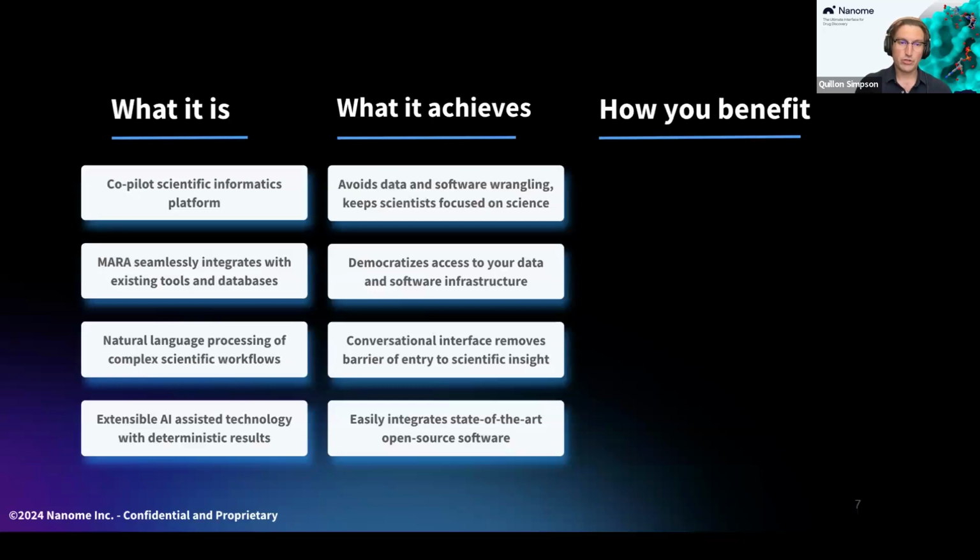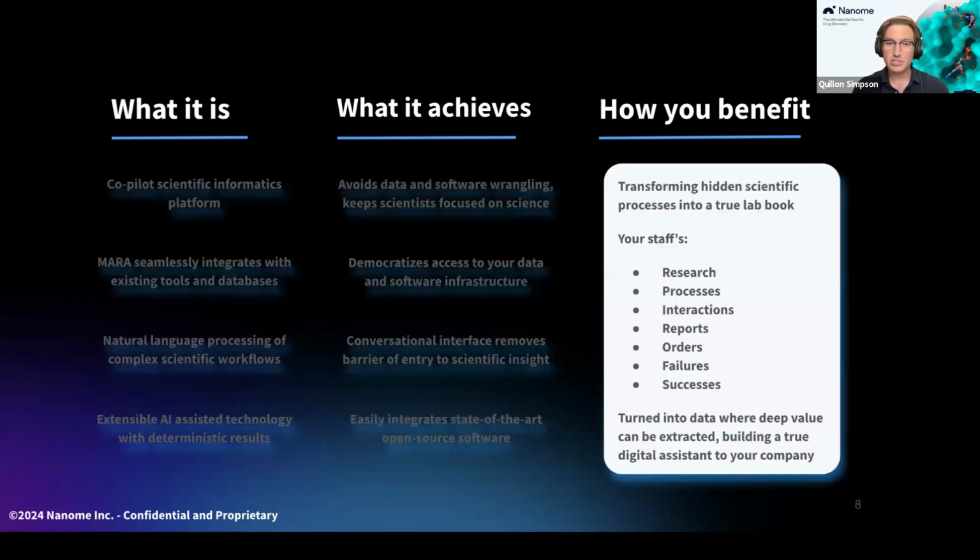You can be assured that access to an easy deployment of the most state-of-the-art tools is always supported in the Mara ecosystem. So in addition to the efficiency benefits you gain from implementing a system like this that connects all of your technology assets together, you also gain the added benefit of contextualizing why your scientists conduct experimentation and not just the experiments themselves. I'll go into that in a little bit more detail later on.